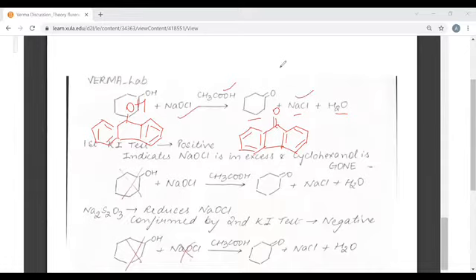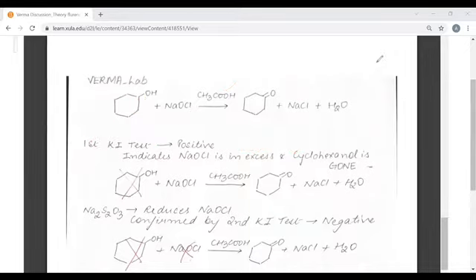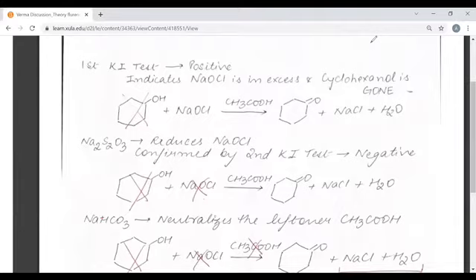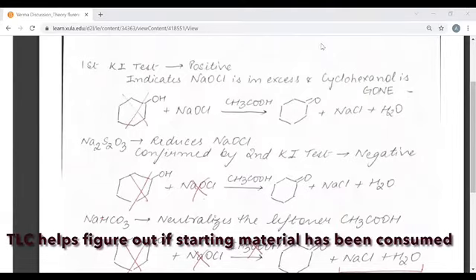Rest of my materials stay the same. So why do we add the sodium thiosulfate? Before that, we always do our potassium iodide test. This test, when conducted on a strip of potassium iodide paper, will give you a black color or a black dot.